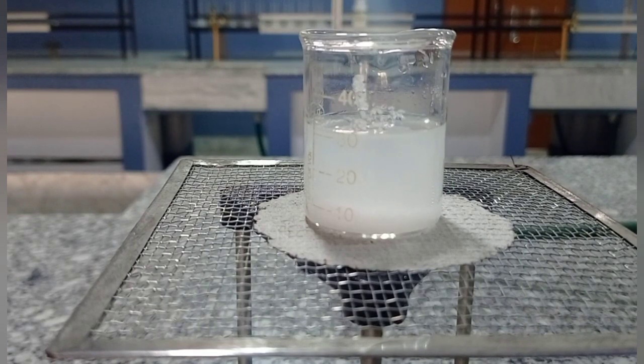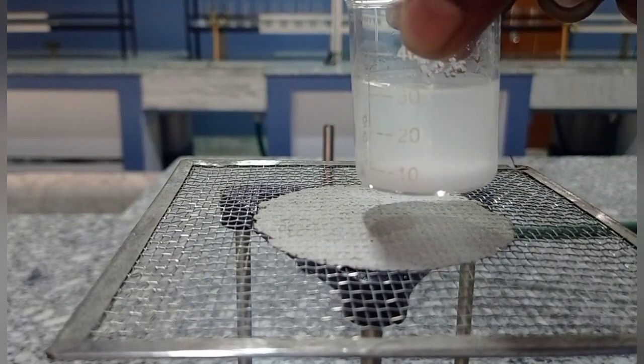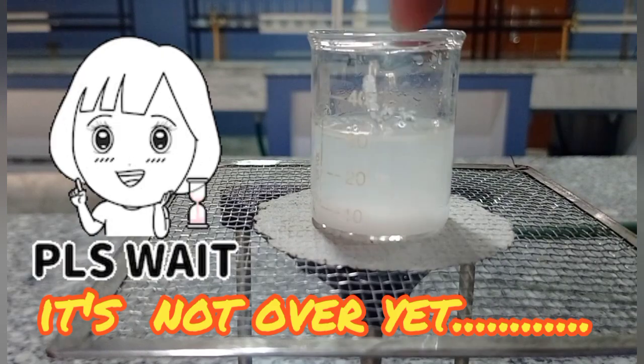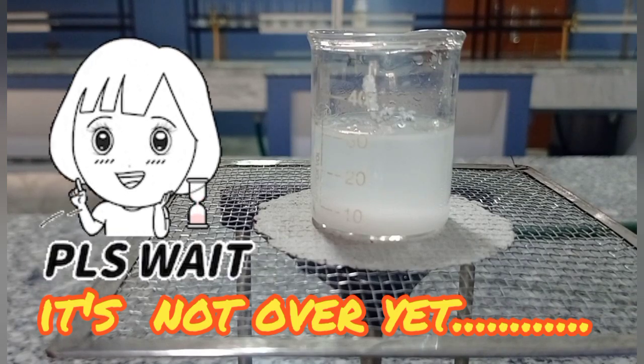This condition is called saturated condition, where the solvent is in a state where no more solute can be dissolved. You can see clearly that at the bottom of this beaker, the salt has not dissolved. This solution is called saturated solution. So I hope by this time you understood what is saturated solution. Now let us move on to prepare supersaturated solution of the same solution. For that I will use hot water.